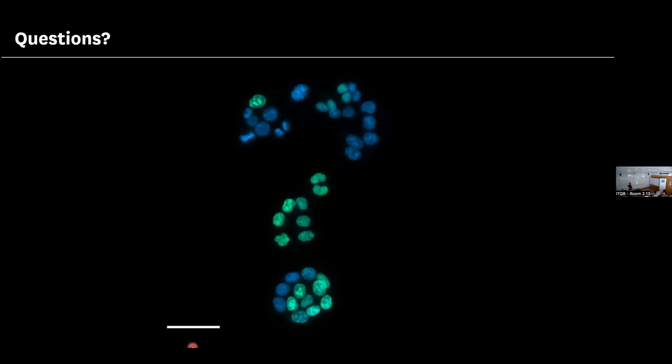Not all of them will work, and not all of them will give you the same results. GFP is fine and Cherry is fine. If you want to do confocal microscopy and multiphoton microscopy with a particular dye, it's highly recommendable to see if it's published already, if there's some use of it. But that's the principle. It's just finding what is the infrared excitation that will excite it the most. And it's not necessarily just the sum of the excitation wavelengths.